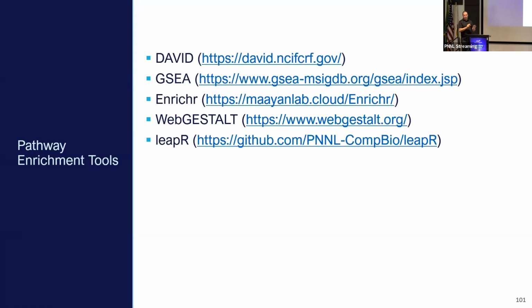And again, this is a non-exhaustive list. These are both ones that are very popular, and ones that I happen to know about and use. And then the last one is just a shameless plug because this is our library that I've built. There are lots and lots of different R libraries that will allow you to do different parts of this. GSEA has an R library that you can use.